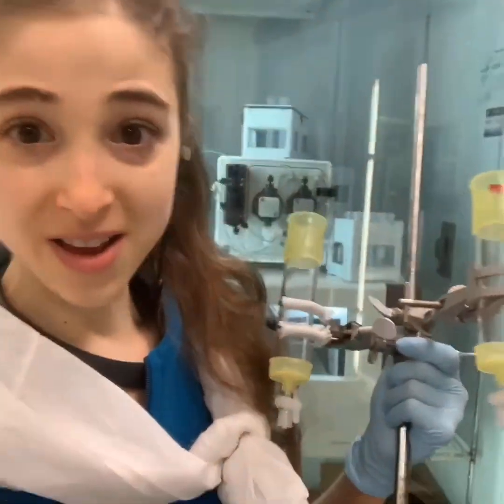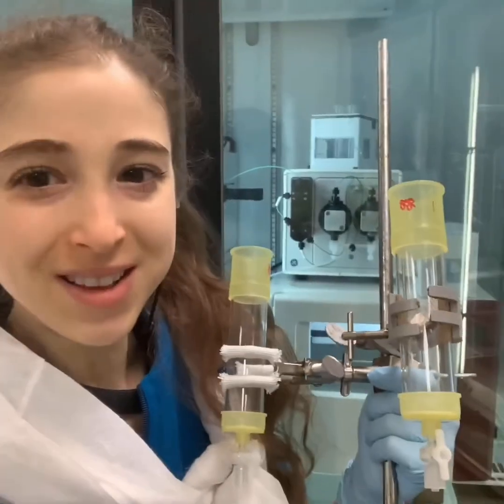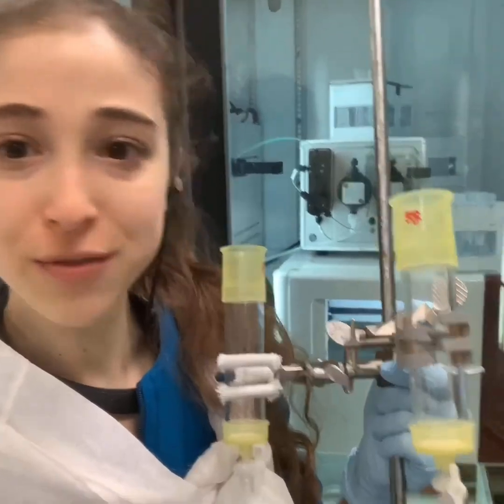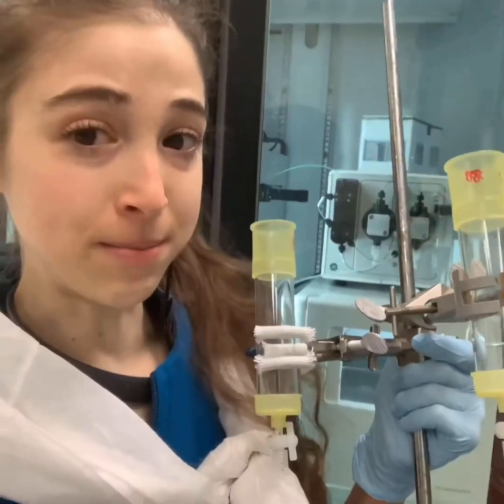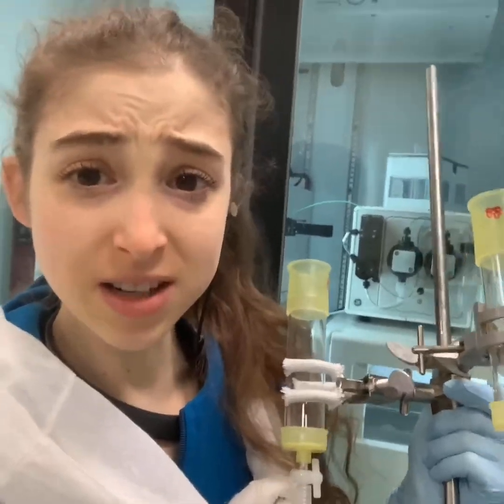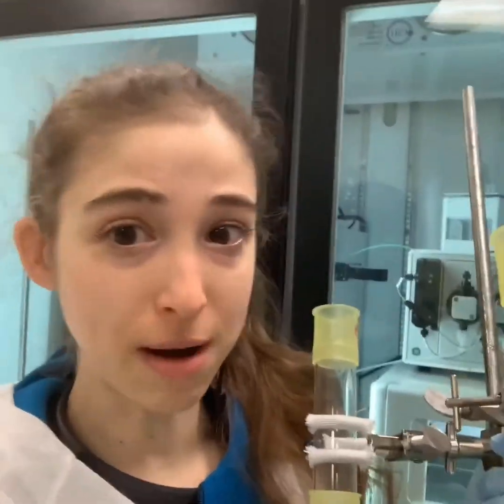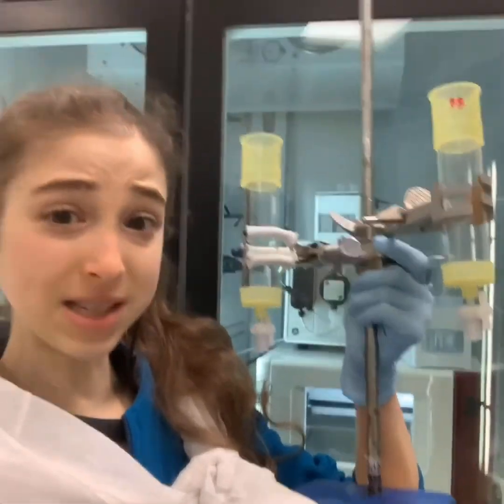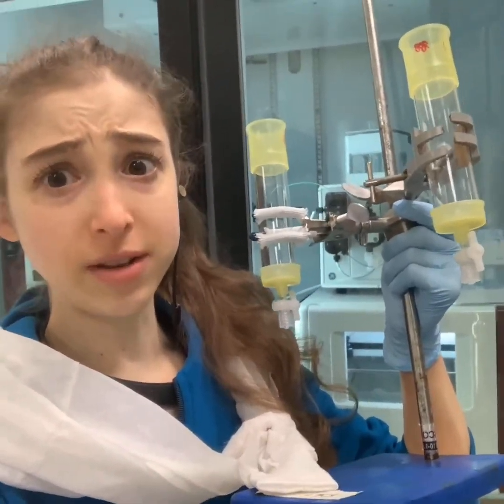Yesterday I showed you a lot of biochemistry lab equipment, but I'm going to show you some of my favorites — the stuff we use for protein chromatography, which is a way that we purify proteins by sending them flowing through different little bead columns formed with different little beads called resin that have different properties that separate proteins based on those properties. We can do it in gravity flow where we fill columns like this, but for that we usually do it in the cold room, which I really, really hate because it's cold.